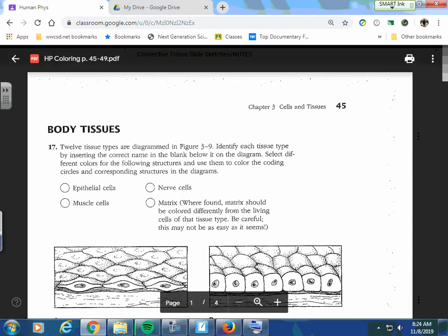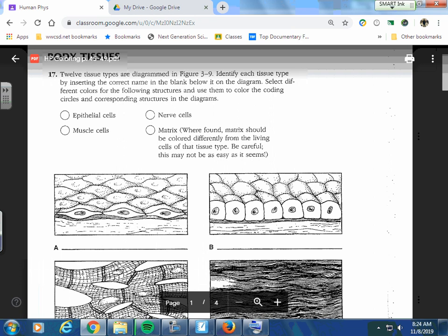Okay, so I wanted to go through these answers real quick on here, tell you what we're looking at. And this should help us with the next thing we're starting today, which is looking at some of the connective tissues and muscle tissue under slides. See if we can make any sense of what we see under the microscope.